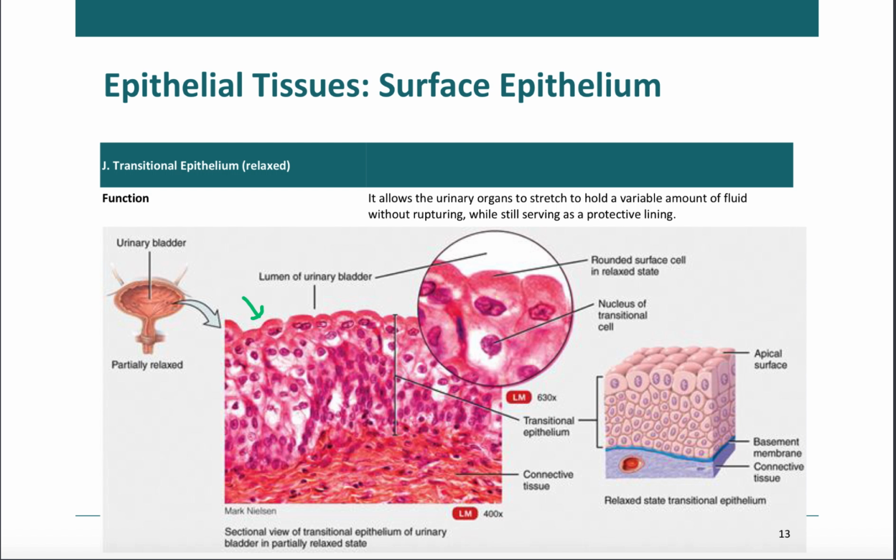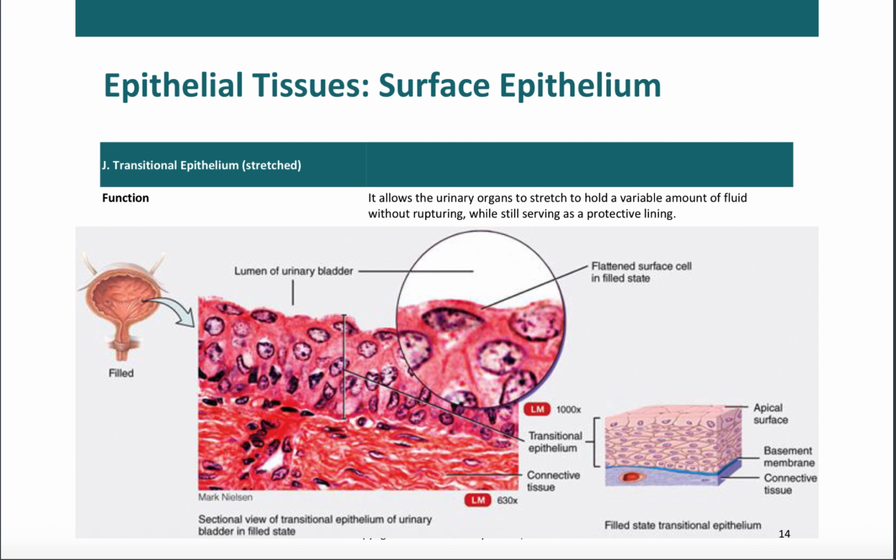Because that top layer is sort of rounded and more puffy. It doesn't look like it's squished at the very top, and the bottom doesn't look rounder than the top necessarily. And even when it's stretched, they're still a little bit curvy. They're still not looking like the absolutely squashed pancake-ness of the top layers of the stratified squamous.